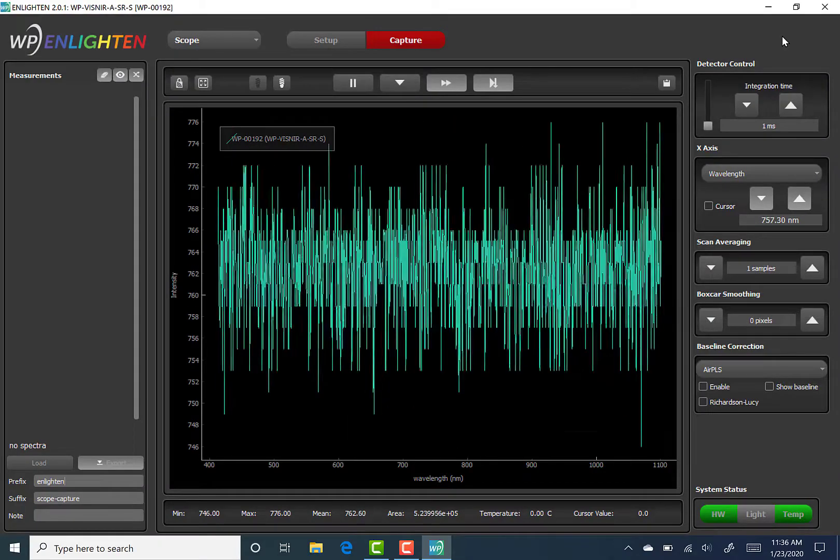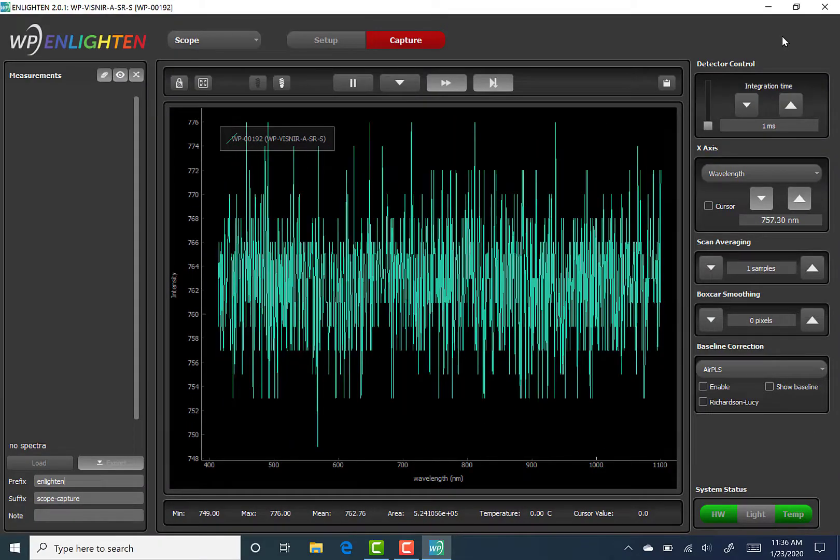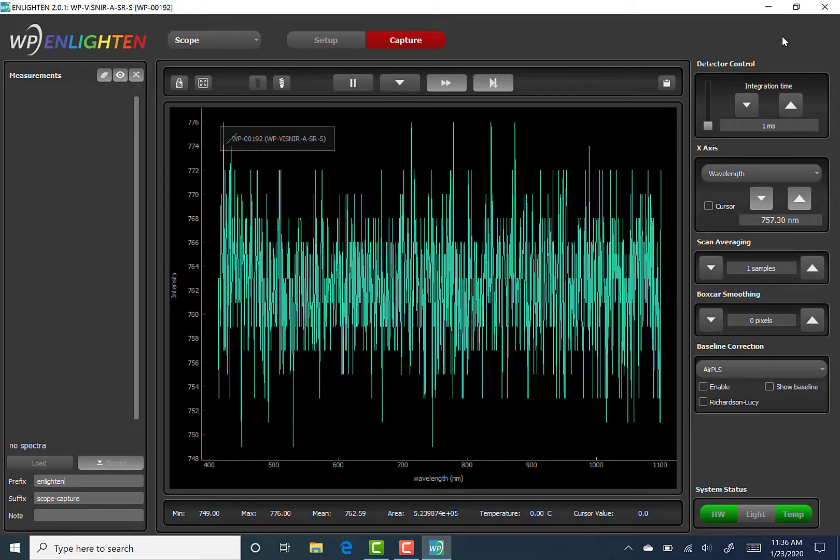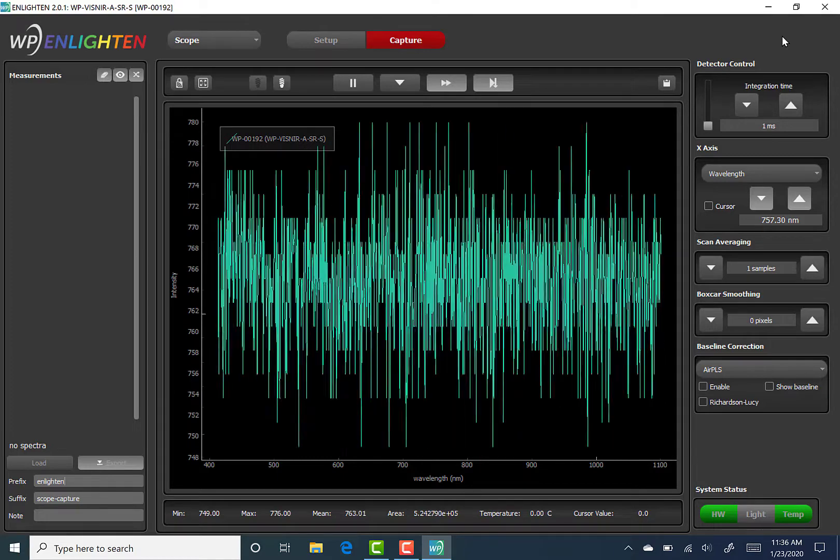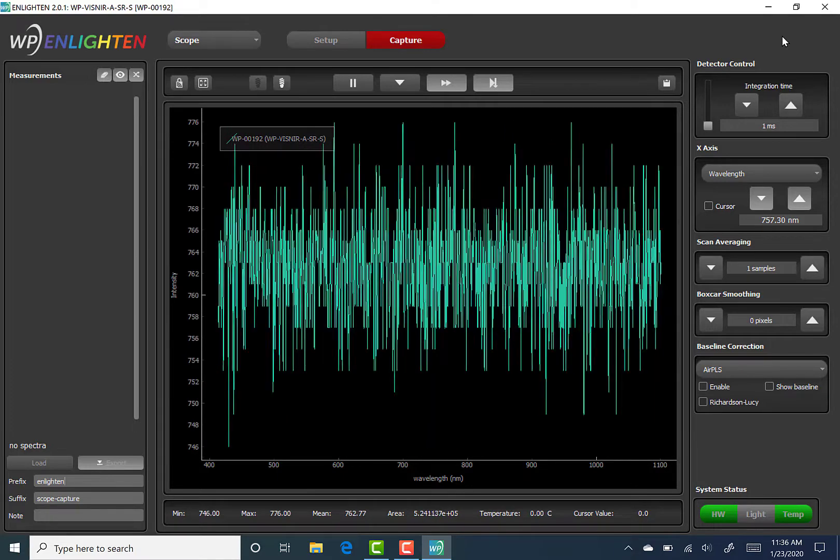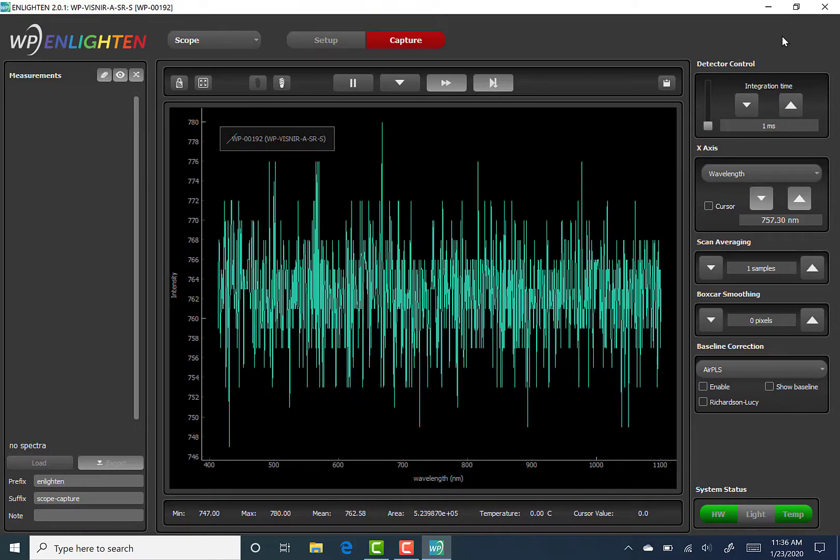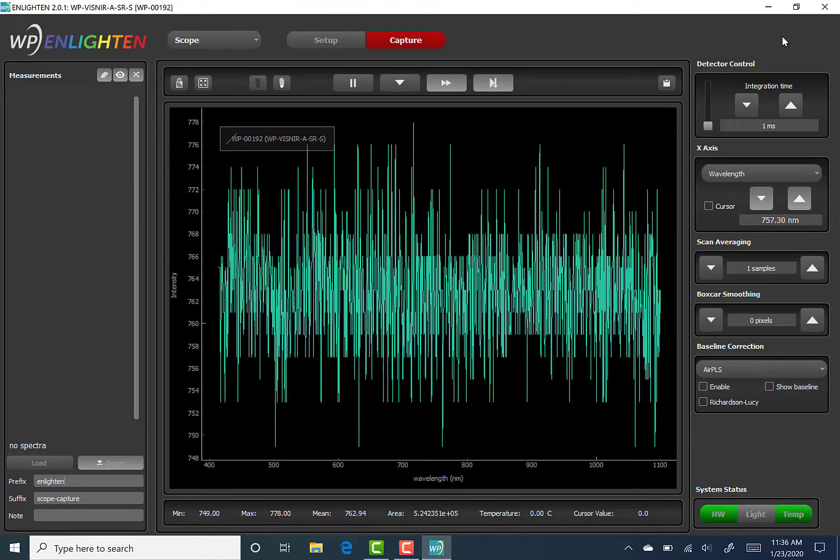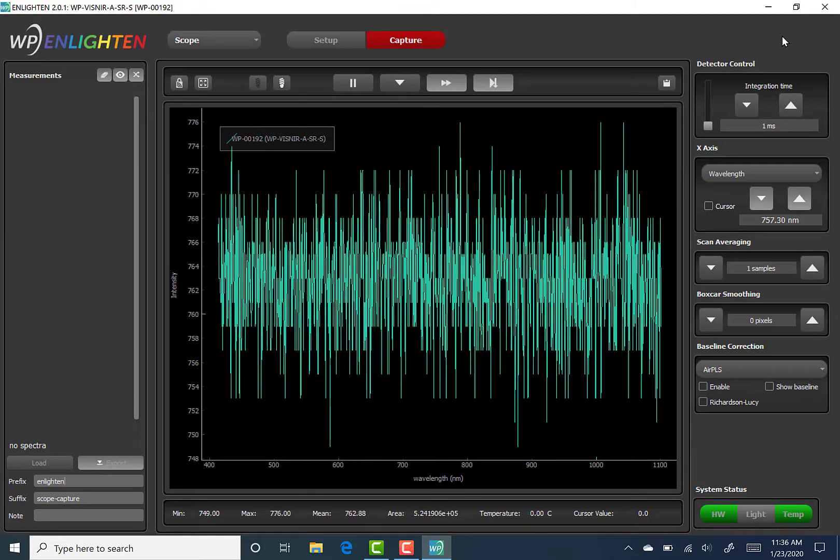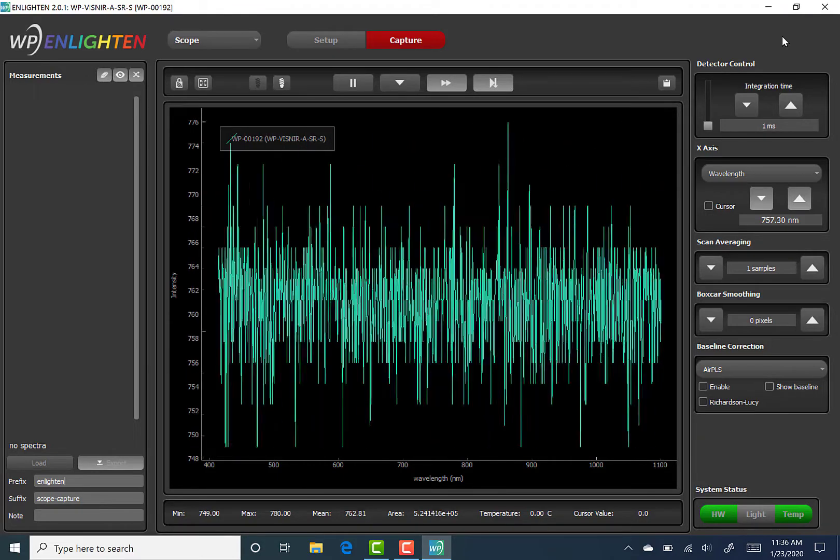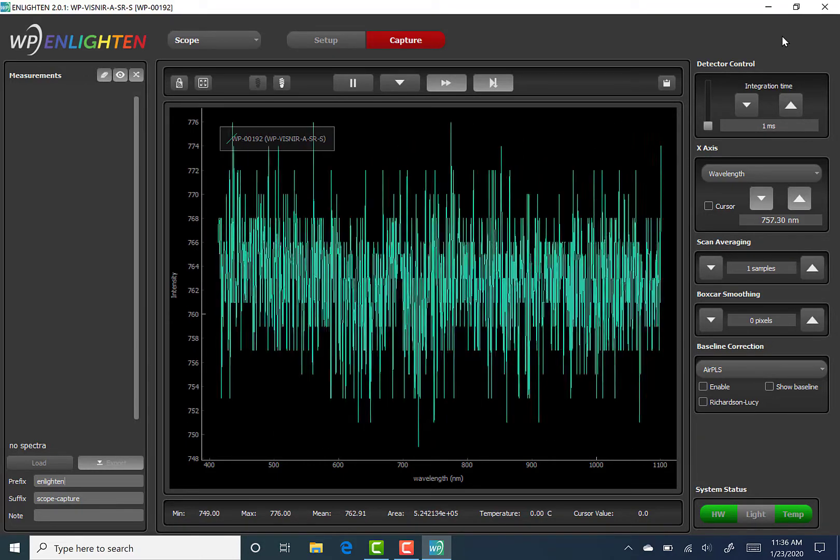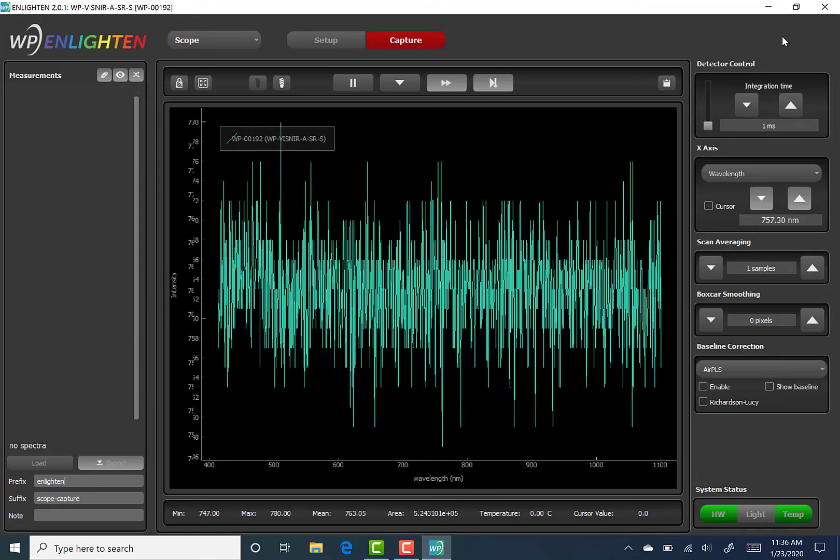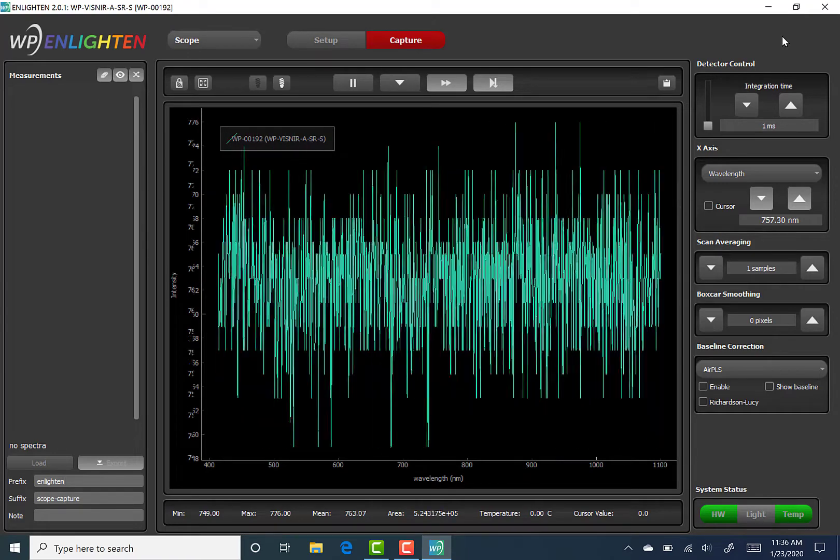It's important to remember from the previous video that not all user controls described in this video will be available as a default during an Enlighten session. This is because certain controls are specific either to certain spectroscopic techniques or certain types of spectrometers.